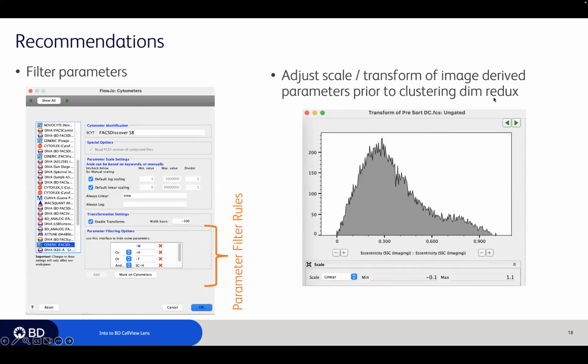Okay, so some recommendations. Interesting. Good question on can we import filter sets in FlowJo images settings from Chorus? You cannot at the moment. I had not thought of that. There are very similar settings in Chorus, they're not identical, but I'm writing that one down as a good suggestion of data that we should maybe be able to pass between different BD software. Great call. Thank you, T-Bolt.